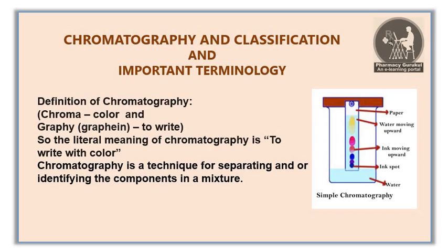It is called the mobile phase, which carries it through a system. The system may be a column or a capillary tube, which is fixed on a material called the stationary phase. The stationary phase is a porous solid that may be glass, paper, silica gel or alumina.